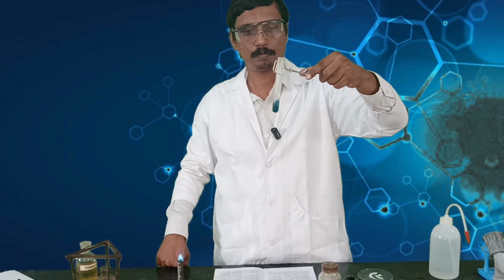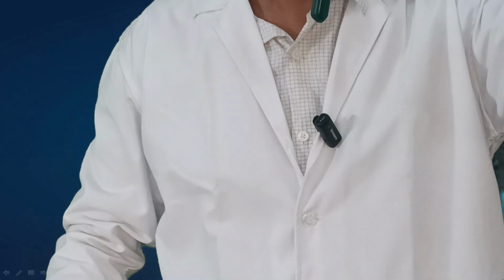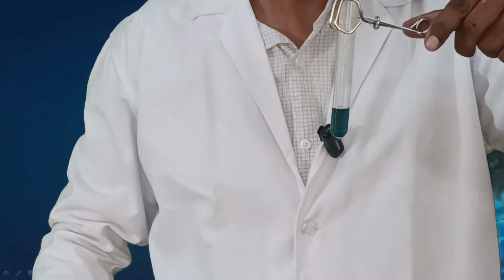Okay. So now you would have observed that the solution, which was brownish, has now turned to blue green, which indicates the presence of nitrogen. If it doesn't turn to either green or blue green, it tells you that your compound doesn't have nitrogen.